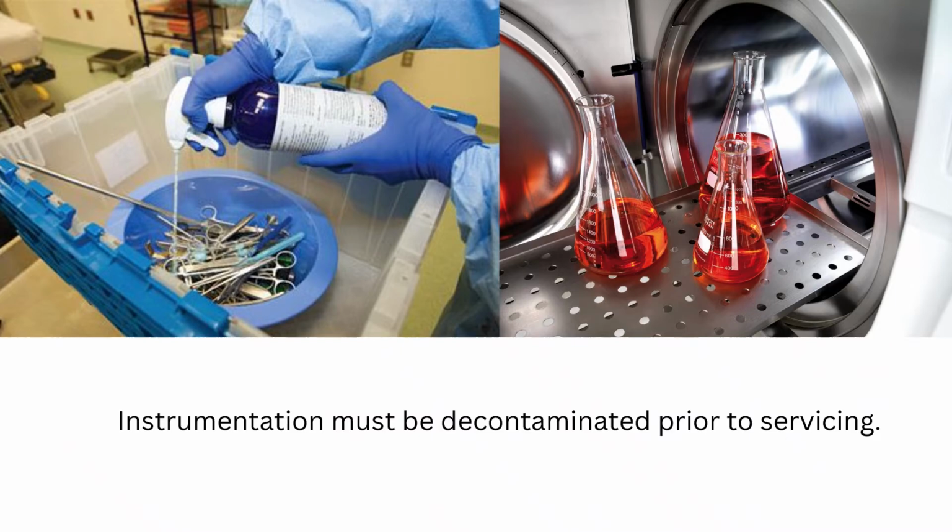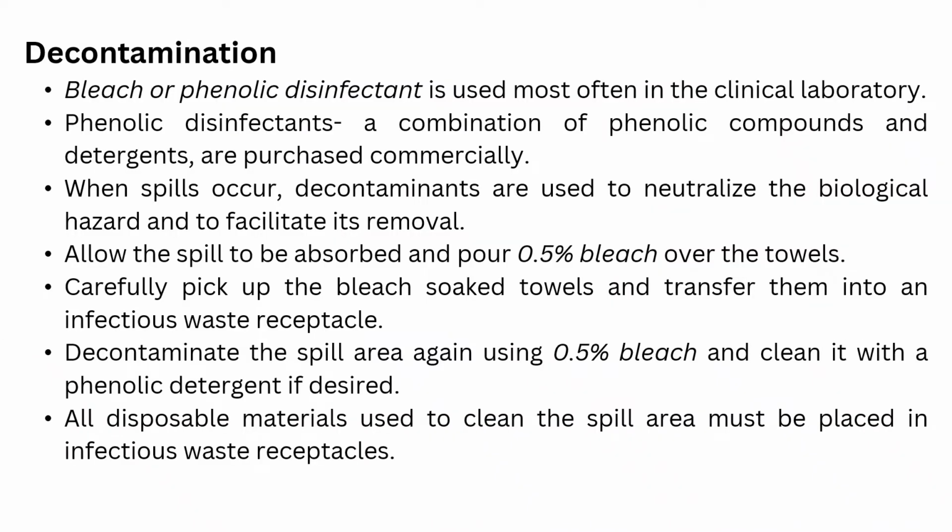Any instrumentation must be decontaminated prior to servicing. This is done to prevent carryover of biological items or cross contamination of biologic substances. Decontamination is actually a combination of processes that removes or destroys contamination so that infectious agents or other contaminants cannot reach a susceptible site in sufficient quantities to initiate infection or other harmful response.